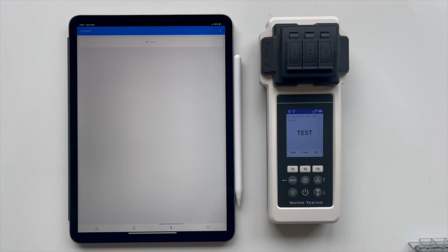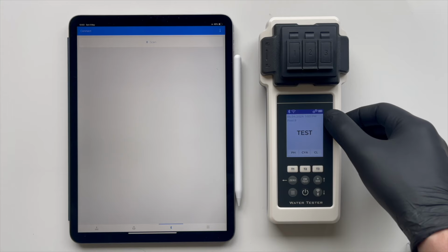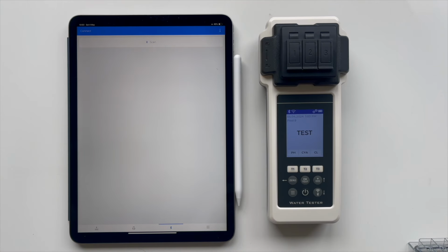We conducted water testing at the designated sampling point, Pool 8, and checked 4 parameters. Based on these results, we will explain how to transfer the test results to the app and how to use the calculator to determine the necessary amount of chemicals for your pool. So, how do we transfer the test results from the PoolWaterLAB tester to the app?